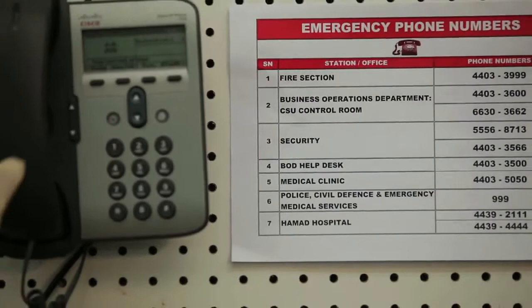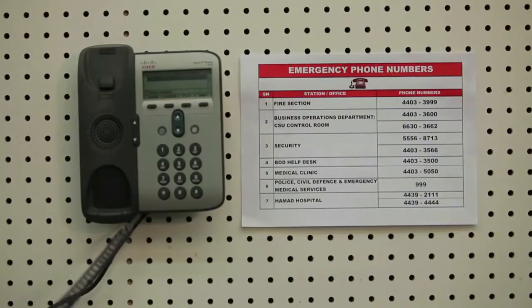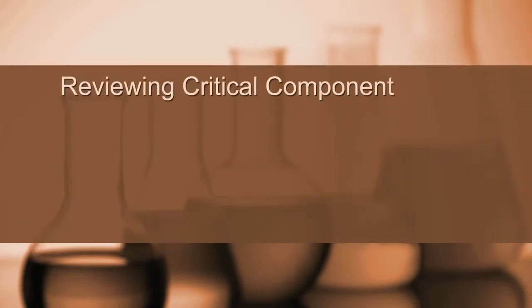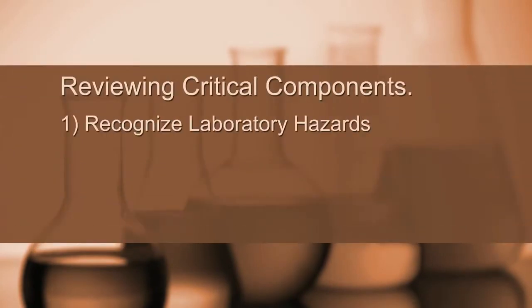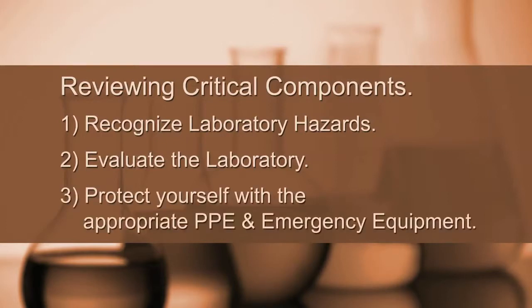Remember to report all fires regardless of size. Also be sure to report any time a fire extinguisher is discharged. In this video, we have identified critical components to fire and life safety for the laboratory. Step 1: recognise the laboratory hazards using the laboratory hazard assessment tool. Step 2: evaluate the lab including your housekeeping practices, storage requirements and fume hood use. Step 3: protect yourself through the selection and use of proper personal protective equipment. Educate yourself on the use of emergency equipment, including a fire extinguisher. Fire and life safety preparation is critical to your health and safety.